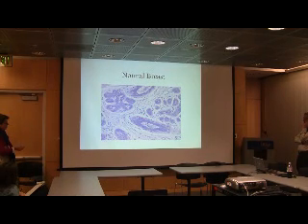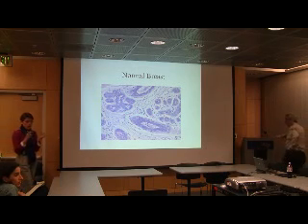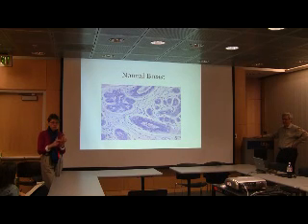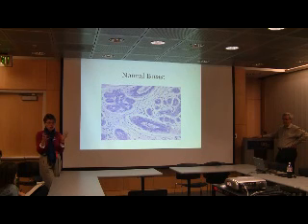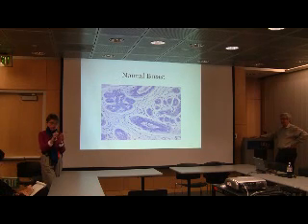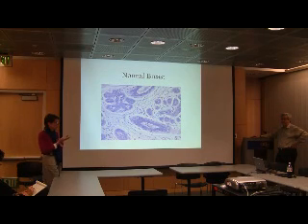But this is an artifact, actually, because the tissue comes fresh from the operating room, but in order to cut it, you have to fix it. So the specimen is put into formalin, and then we cut those 3 millimeter, 4 millimeter pieces out of the specimen. And then those are embedded into paraffin, so they're hardened, and they sit in a little cassette with wax.